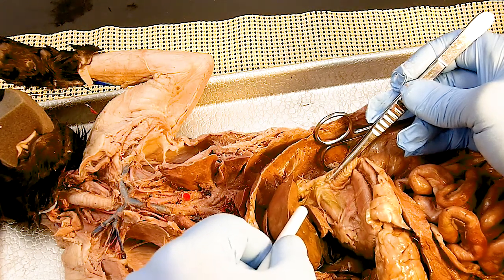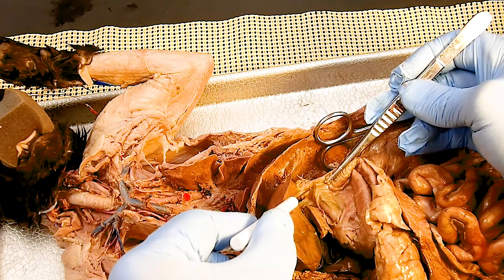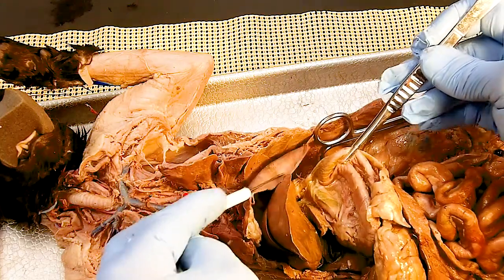So if I put a little pin in there, let's say where that pin is during the lab, if I wanted the valve, since it's not clear exactly where it is, the question will ask you to identify, and then in quotes it'll say valve or something. And you'd want cardiac sphincter or gastroesophageal sphincter. Then you got the stomach.